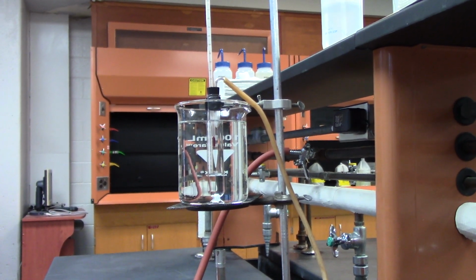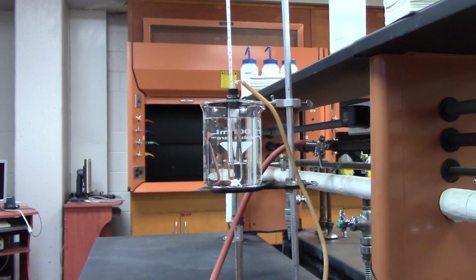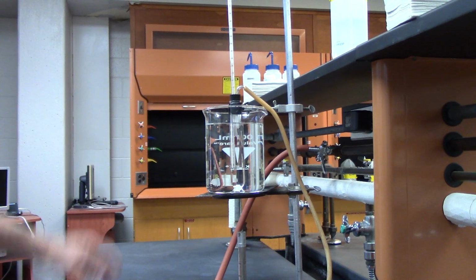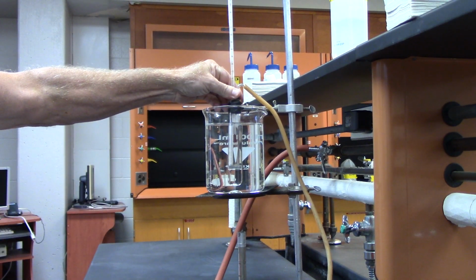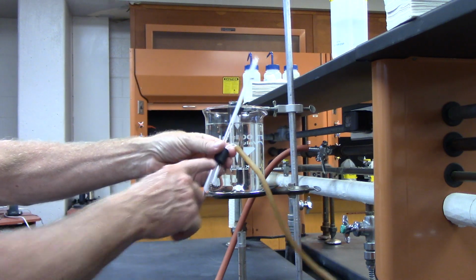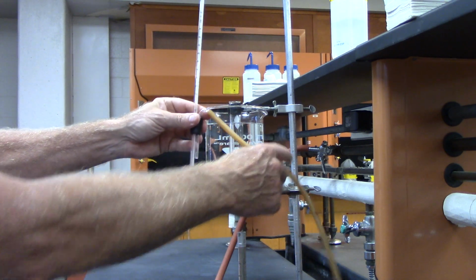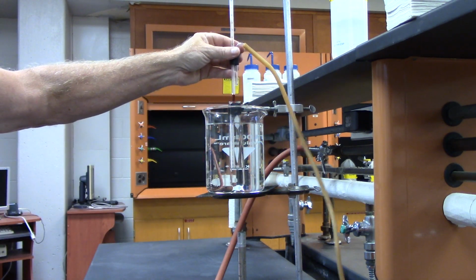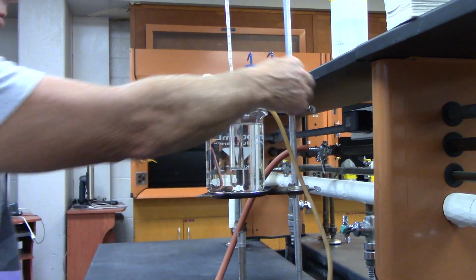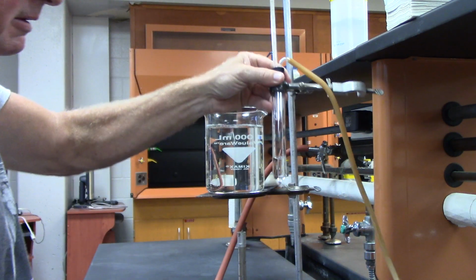Okay. Show you the components here. Okay, this is a 1,000 ml beaker, and this thing is a thermometer. A test tube, and has a glass tube connected to rubber tubing, and I'll tell you what that does in a minute. My unknown is in the test tube. All right there.